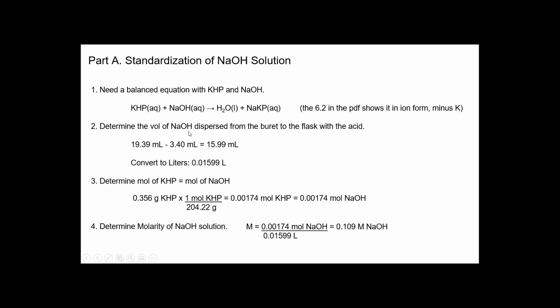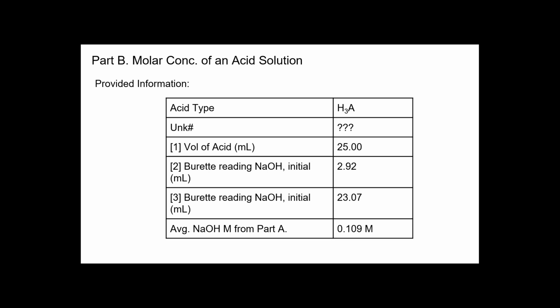Okay, so this should not be too bad. You actually did something very similar in Lab 9. Now it's going to change a little bit. You also did this part in Lab 9. However, now we have 3 different types of acid. So if you get a monoprotic acid, it's definitely the same as Lab 9. If you get a diprotic or a triprotic, it's not.